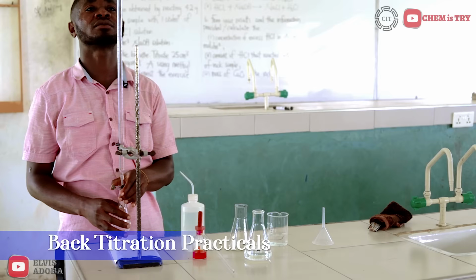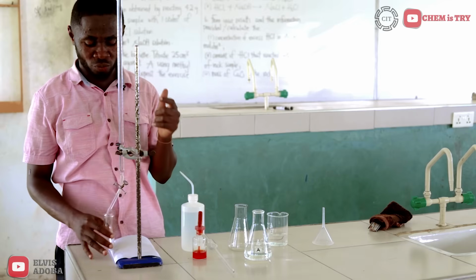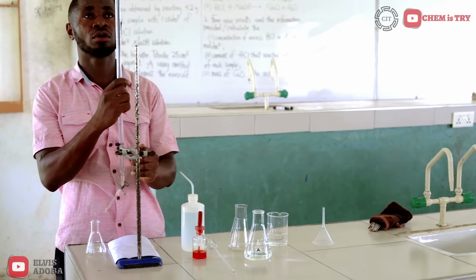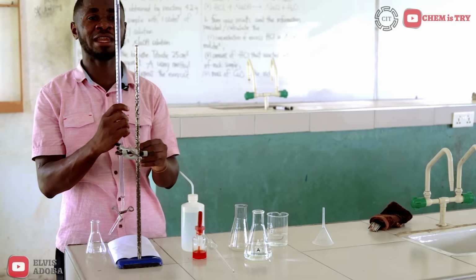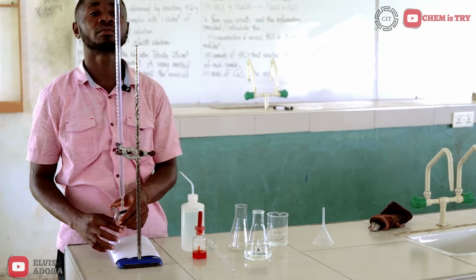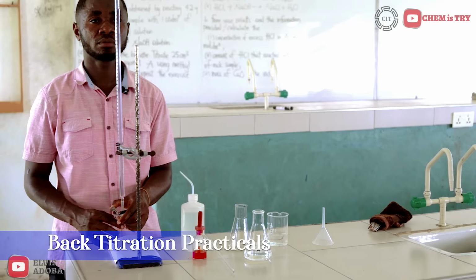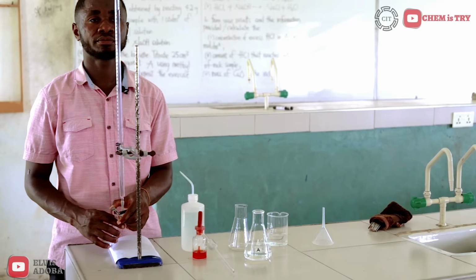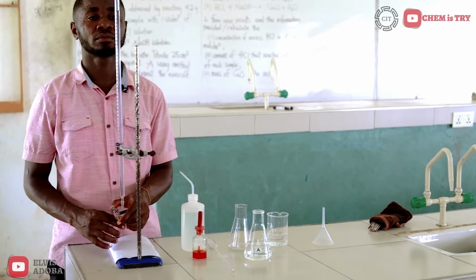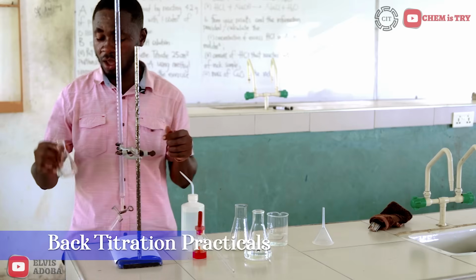So I adjust to the 0th mark. As it stands, I'm not reading at eye level. So what I'm supposed to do is to bring it down a bit so that I can get the eye level reading. Now I have the bottom of the meniscus sitting on the 0th mark.